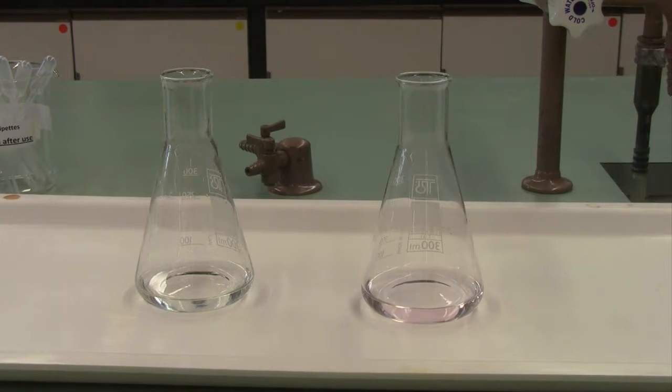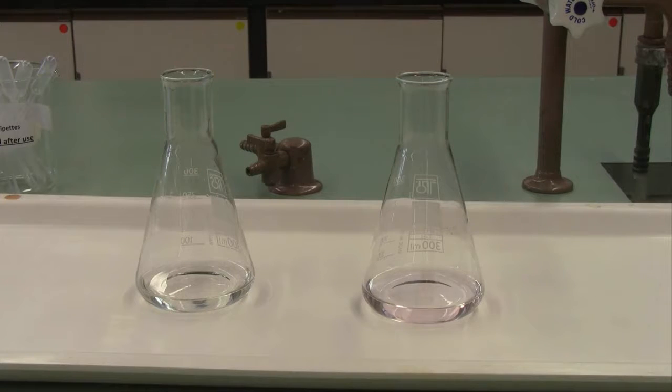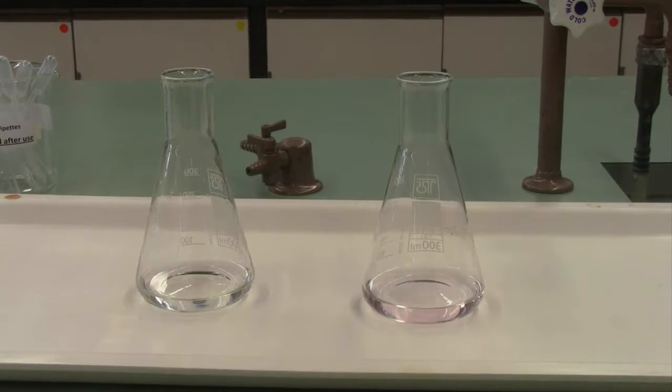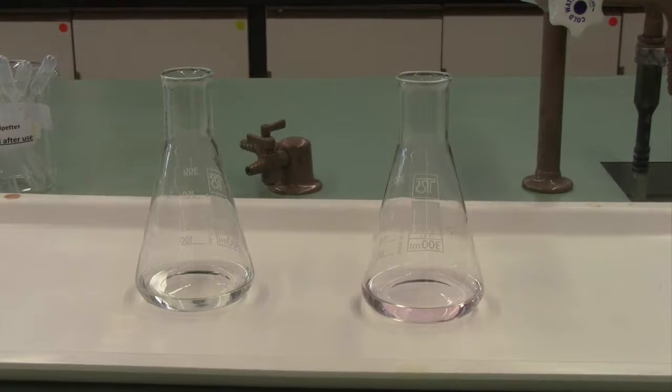Note that you don't expect your titers to be the same for each titration. You'll be using a different mass of potassium hydrogen phthalate each time, which will result in a different titer. You'll need to calculate your titer to mass ratios for each of the titrations, and once you have three concordant titer to mass ratios, three values all well within one percent of each other, then you're ready to proceed to the next section.